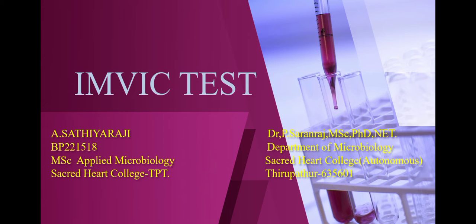And today we are discussing the enzyme-based biochemical test of the IMViC test.